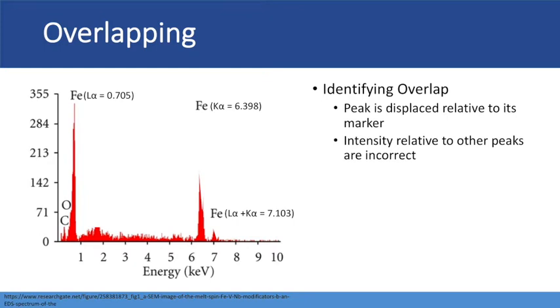then it can be assumed that there is an overlapping occurring at the L-alpha wavelength that is causing it to be artificially higher. In this example, the overlap could be from tin, whose M line is only 1/100th of a decimal point off from the iron L-alpha line.